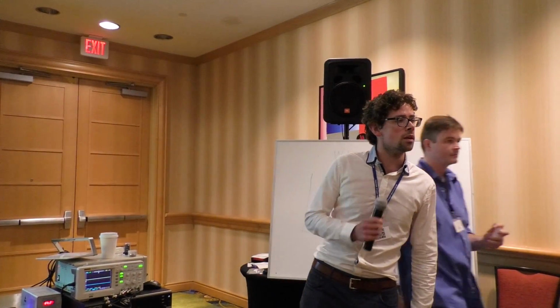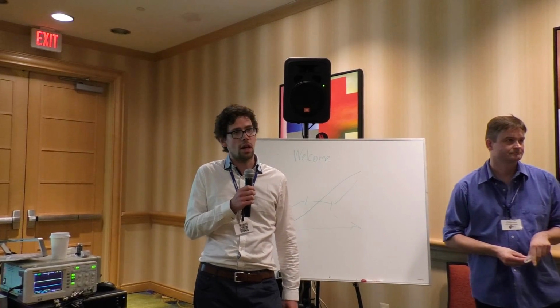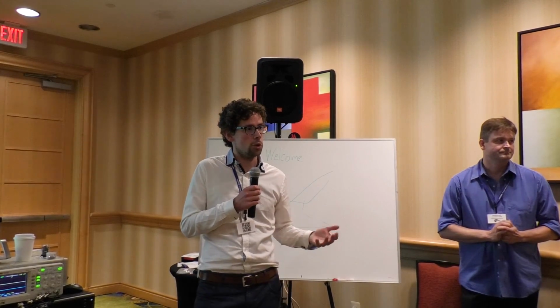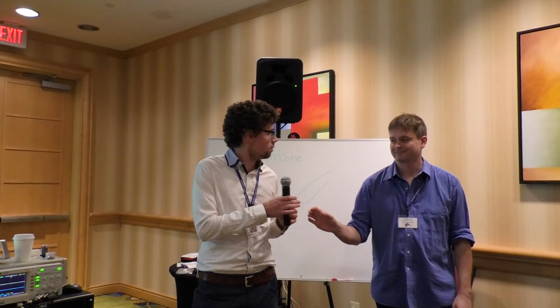I'm sorry? If it does point spread functions as well, you say? I think it just fits two-dimensional Gaussians, so it only takes an asymmetry measure and compares it to the diffraction-limited case. You do get average bead analysis over the field of view that you could use to do further point spread function analysis. I don't think that's implemented in this version of the software.